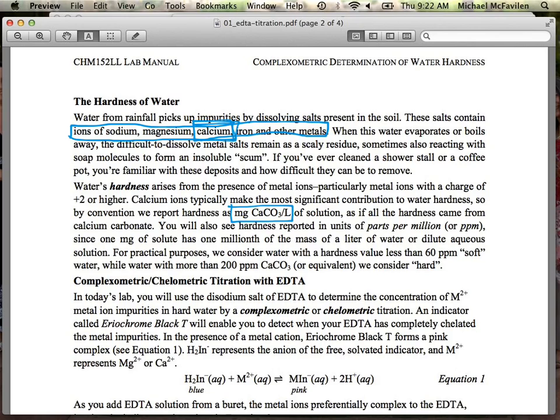Unfortunately, you get a lot of this kind of stuff. By convention, we just decided it. Okay? What was that convention from? It was probably a series of non-scientist people testing water hardness, and the easiest way for them to measure water hardness was something that they could actually weigh out and get a numerical value for, hence a mass and a volume.